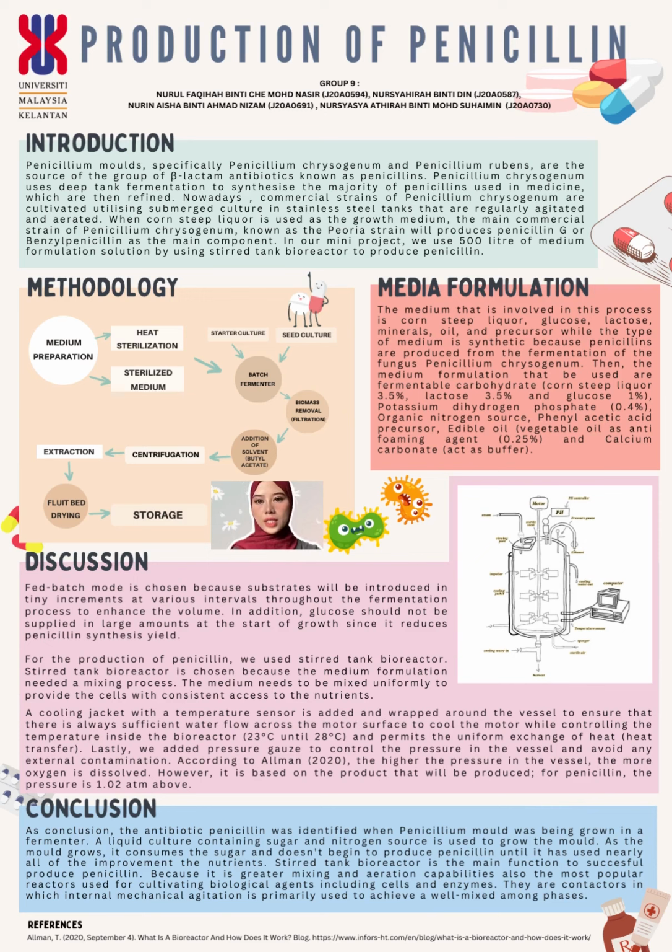And next, extraction. The penicillin is then extracted from the medium using a solvent. And next, fluid bed drying. The extracted penicillin is then dried using a fluid bed dryer. And lastly, storage. The dry penicillin is then stored in sterile containers until it is ready for use.